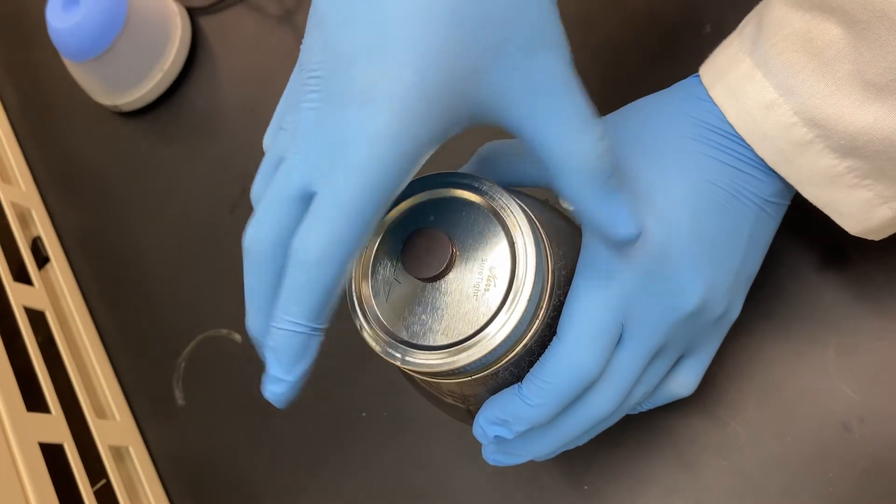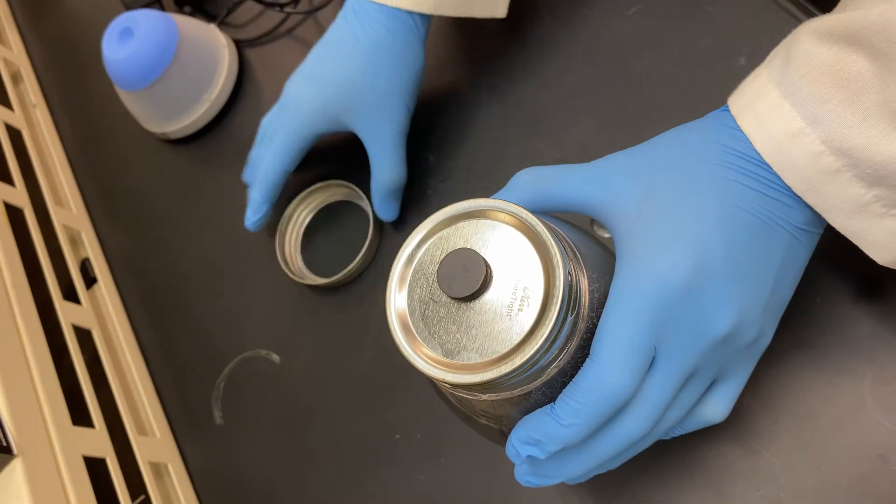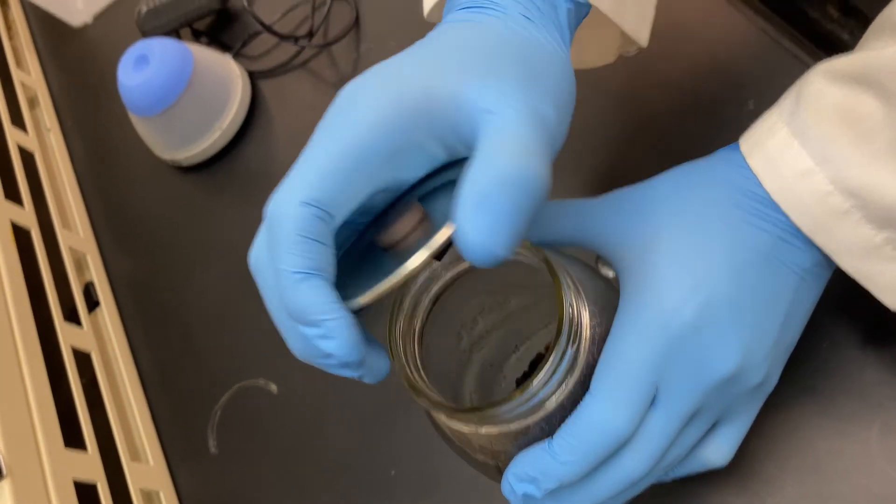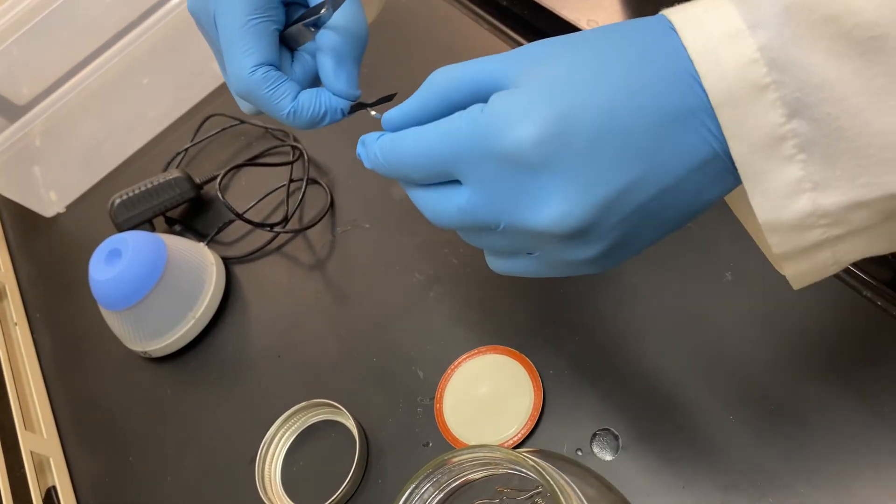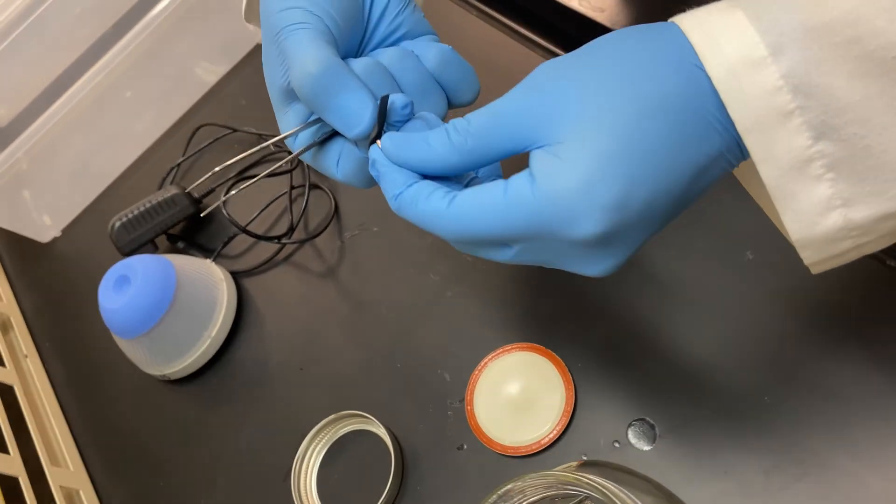Once cooled, remove the mason jar from the oven and into your fume hood. Open it and remove the activated charcoal strip using clean gloves and tweezers. Make sure you sanitize your tweezers before removing the strip.